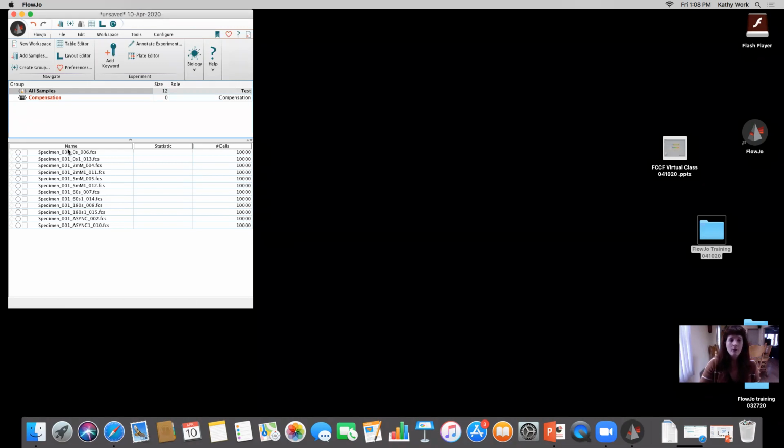Then we're going to start looking at our data. Before diving too deep, I want to say thank you to one of our researchers at Memorial Sloan Kettering for being kind enough to share some of this data with us. I won't call her out by name because I'm not sure if she wants that. She knows who she is, and we're very appreciative of her donating some of these files for analysis.